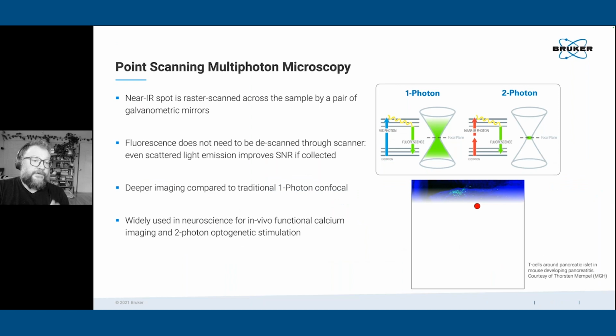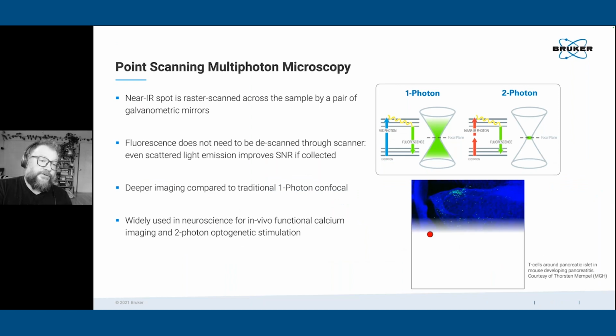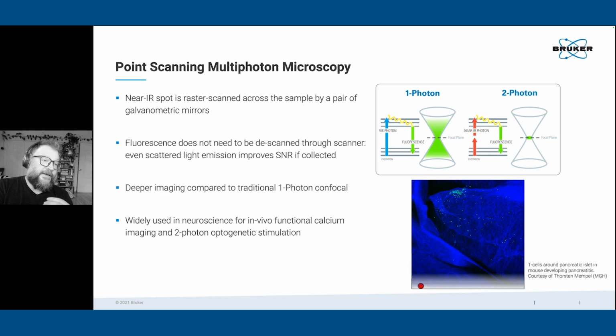Those of you who are totally unfamiliar with the technology that we use, it's a scanning microscope. So it's very similar in concept to confocal microscopy, if you're familiar with that. In one photon confocal microscopy, illumination occurs across like a cone, essentially, of light with a focal plane and a pinhole that is also used for descanning for optical sectioning.